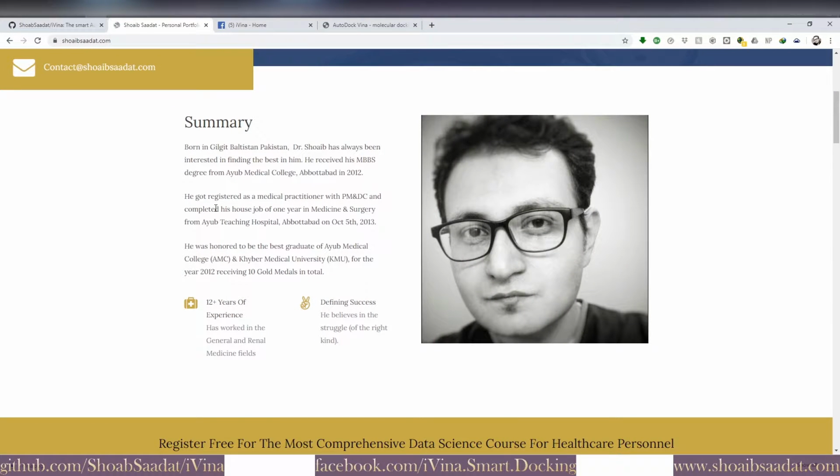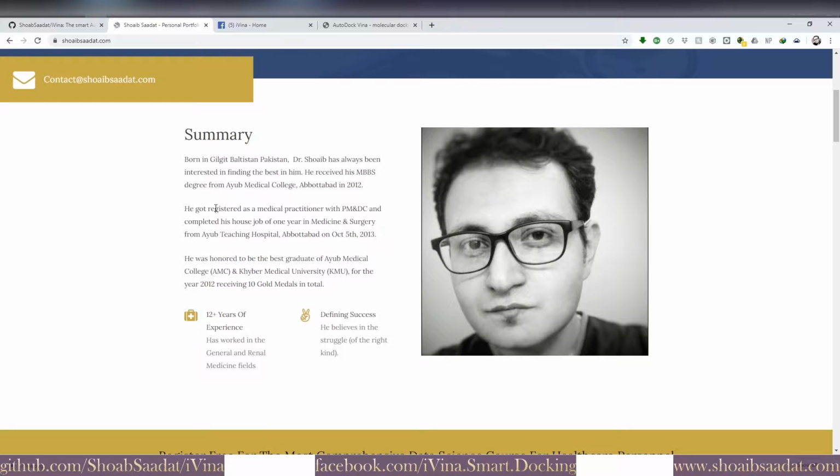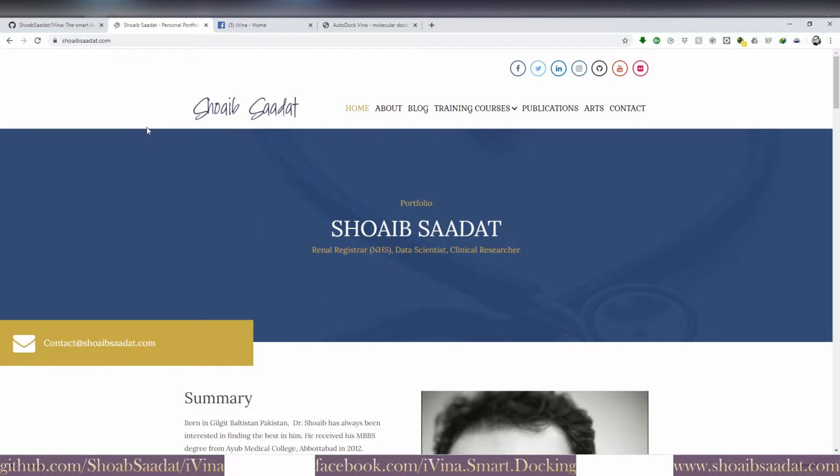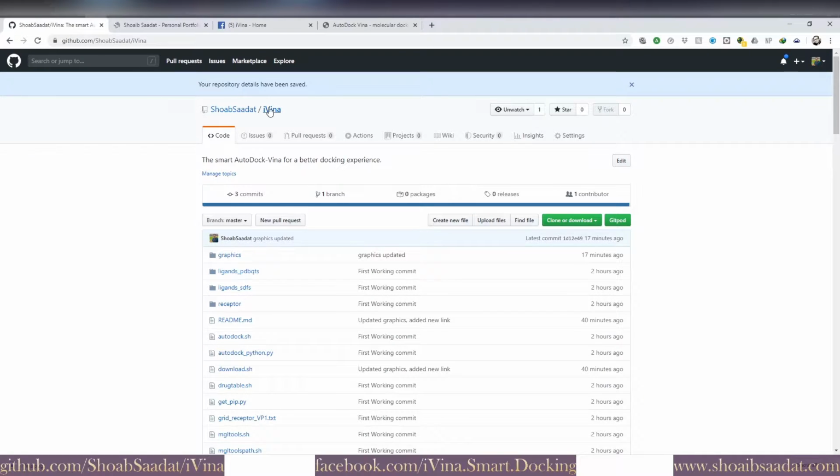You would have already seen some of my videos on my YouTube channel. This is one of the other videos that I've made, and the idea is to introduce you to something called iVina. It's a project that I started a few days back, and the idea is basically to improve the docking experience that we have.